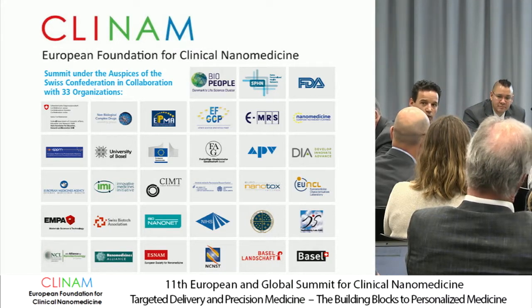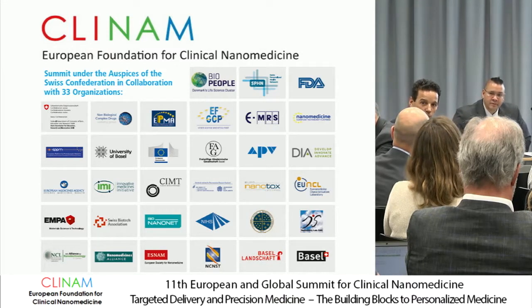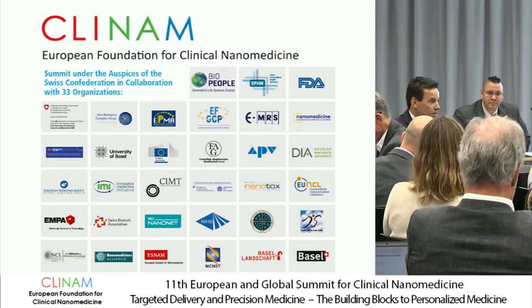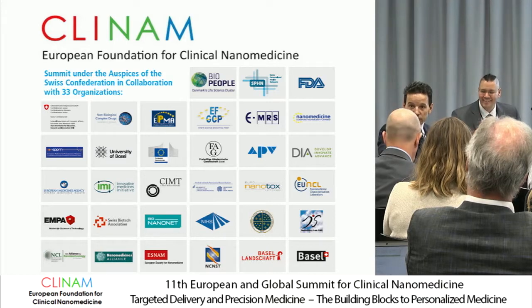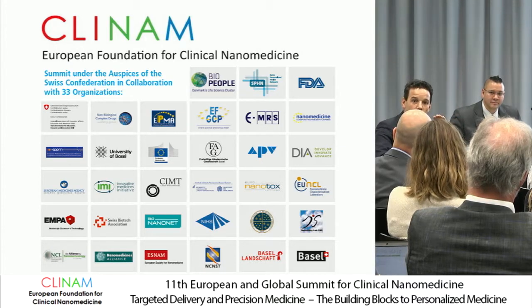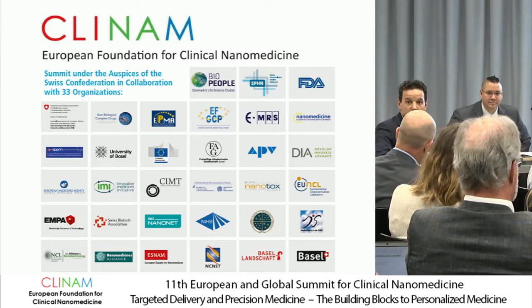Obviously, in our case, we are dealing with a complex system where you have an active component. And the way that it is packaged determines how you have to measure it to not compromise it or to actually expose it and then measure it. And as you saw from the presentation, we also have different needs in terms of assessing the molecular chain and the density of the packing versus the complexity of the hydrophobicity versus the protein corona formation. So it is valuable, and it could be a dialogue that could be opened from that perspective. Again, with a view of doing risk as well, because one of the aspects that Frank has also highlighted is safety.